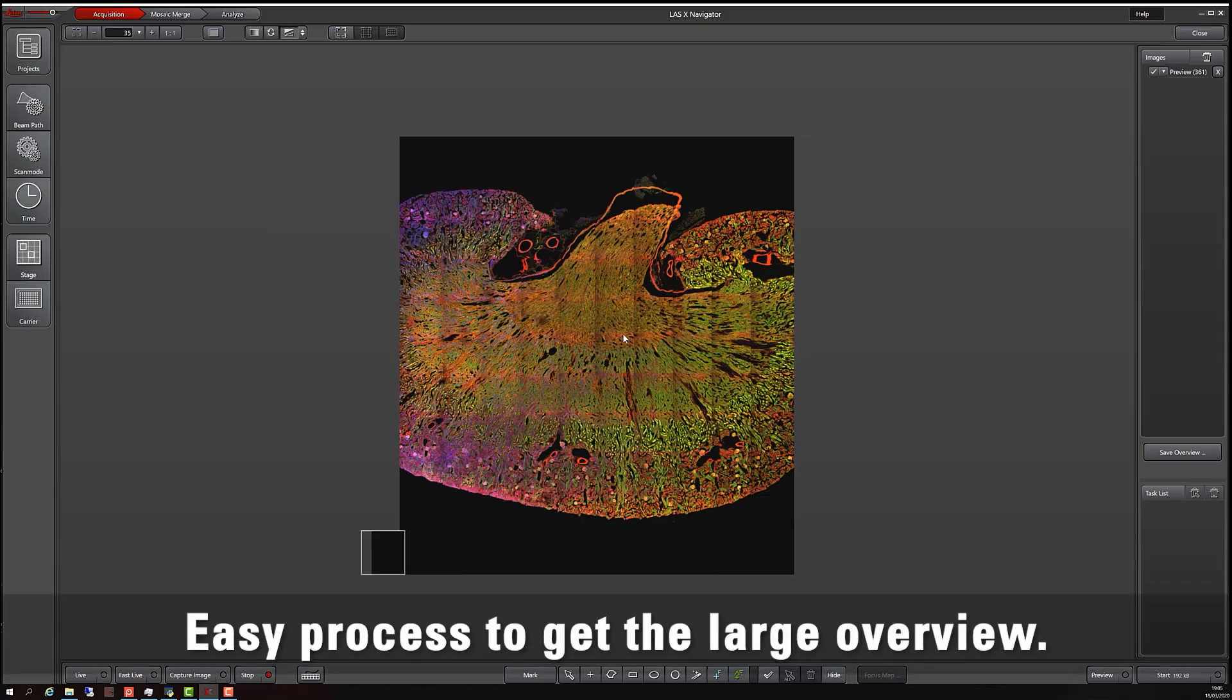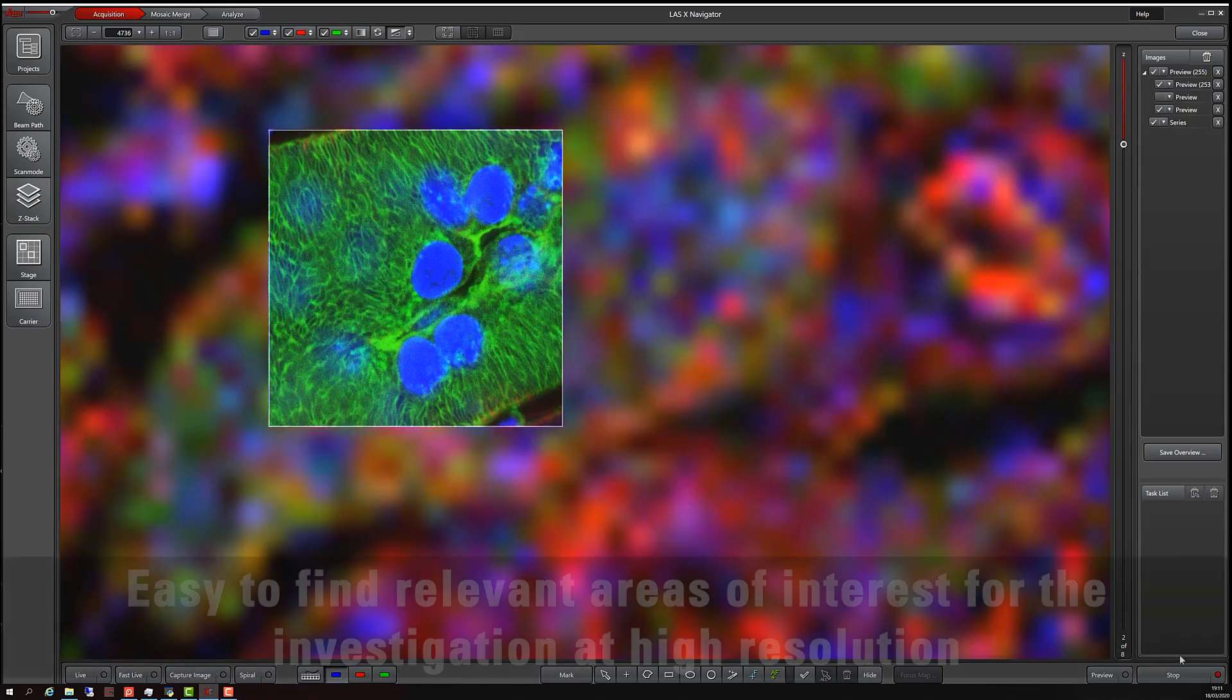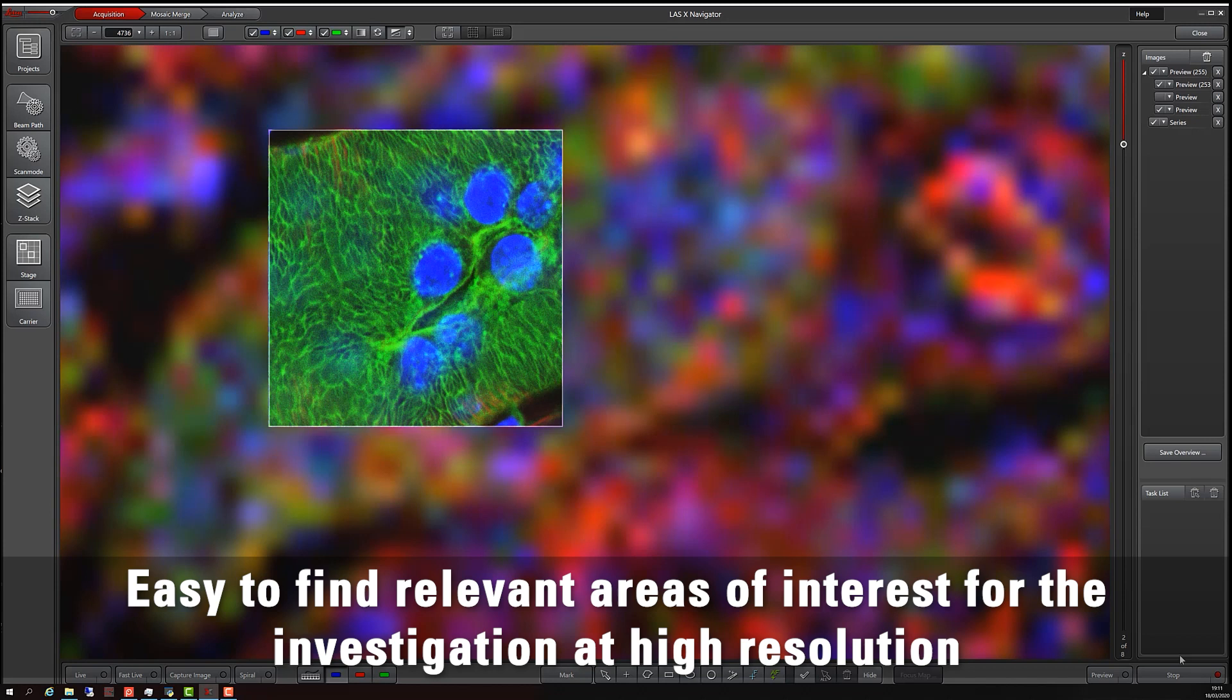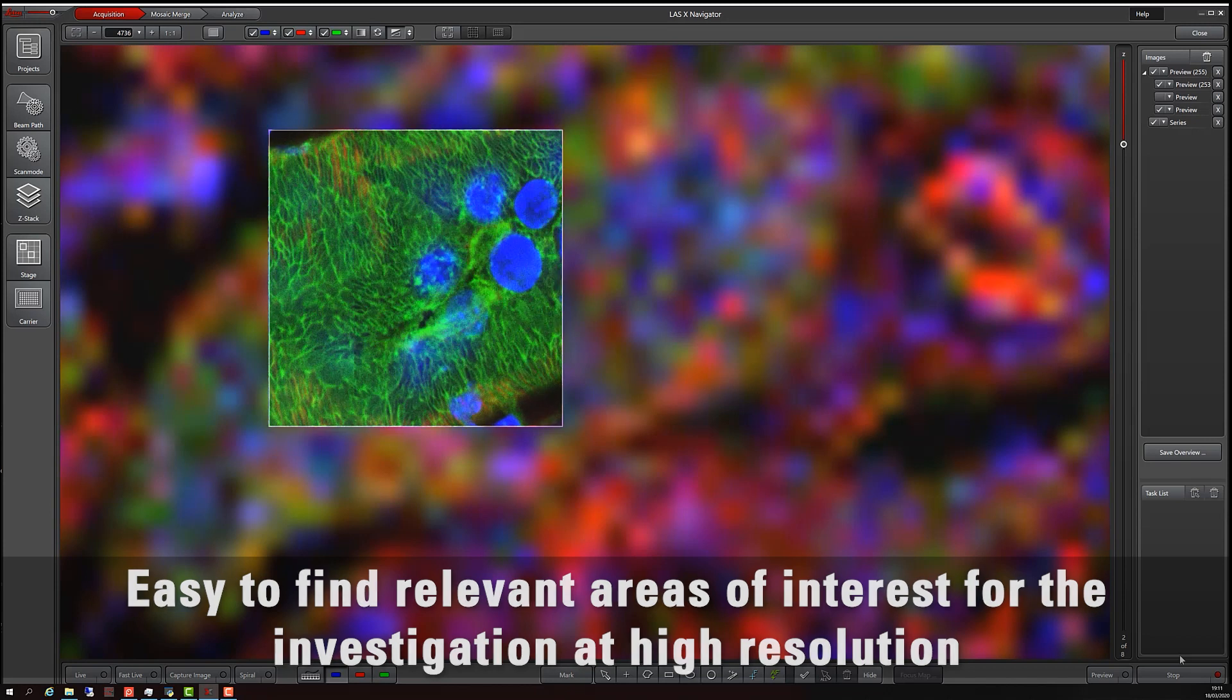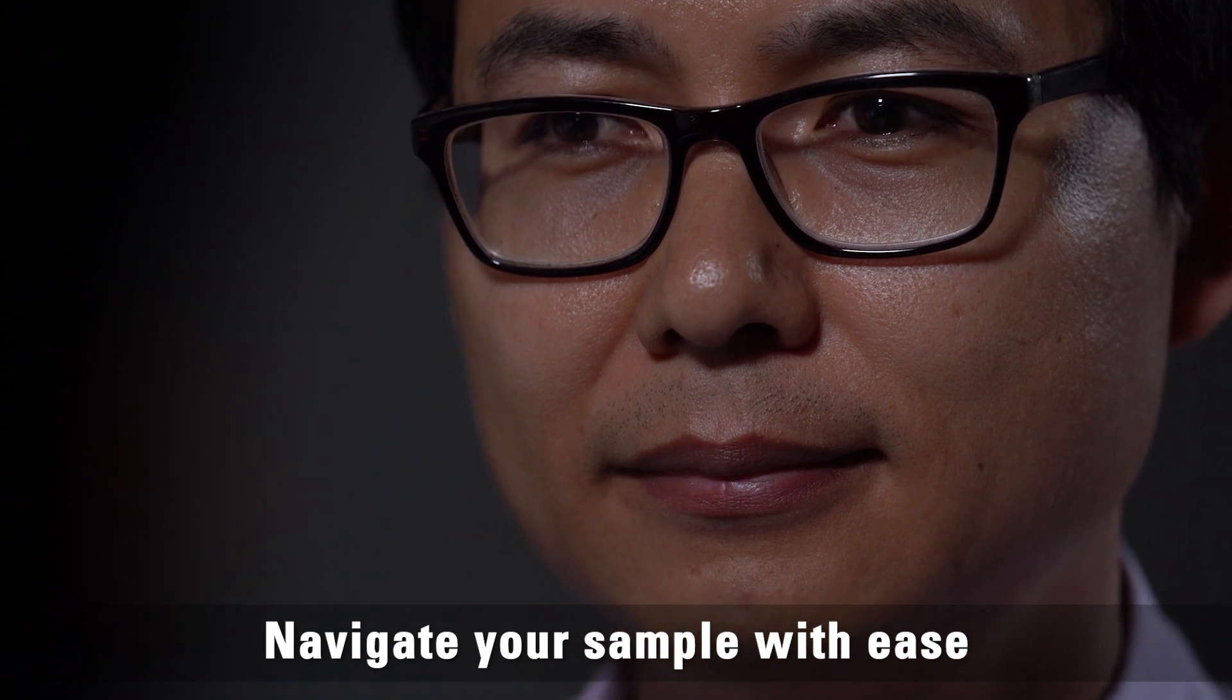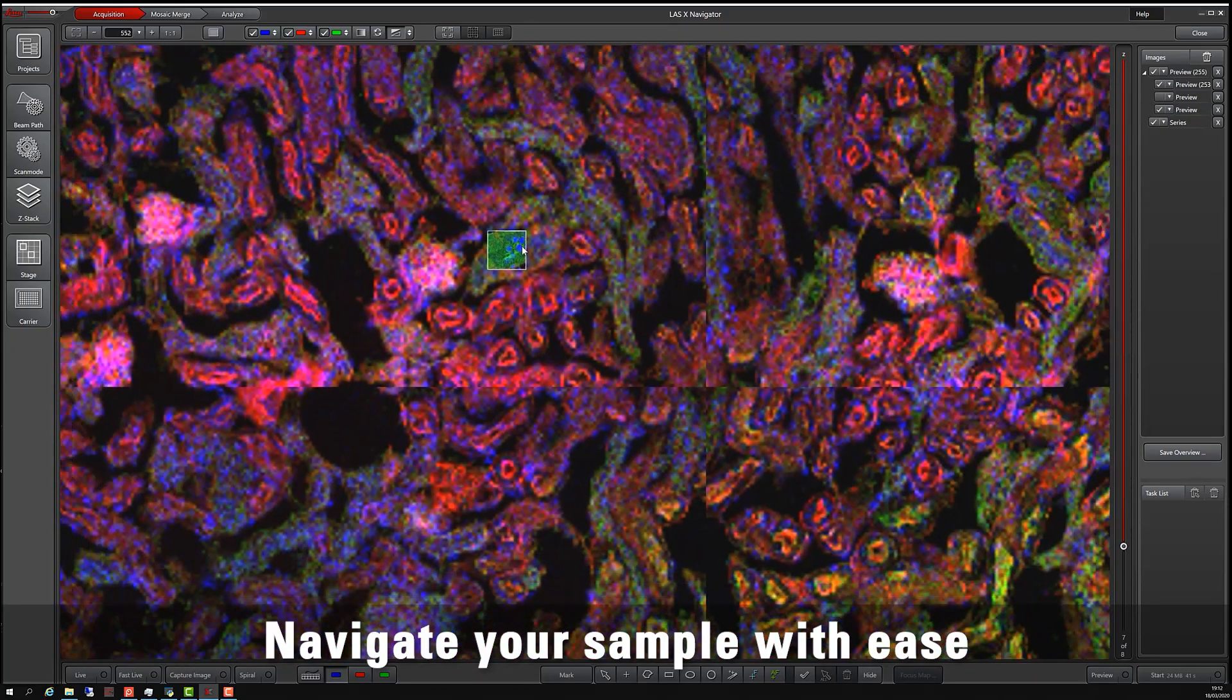Start with a spiral scan at low resolution. Mark areas of interest and scan them with high resolution in 3D to make fine details visible. All image data can be navigated by you in a single view with the LASX Navigator.